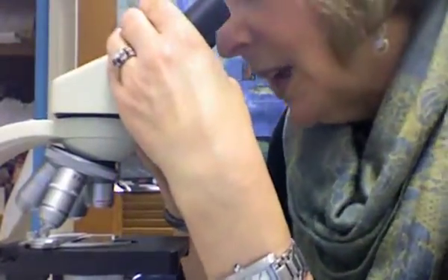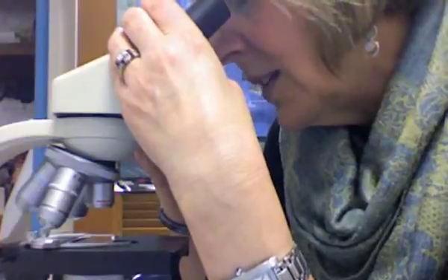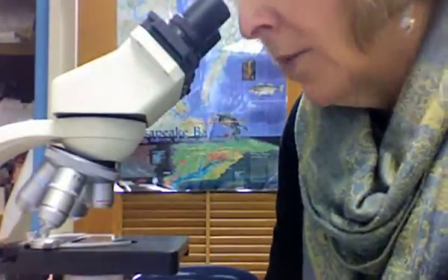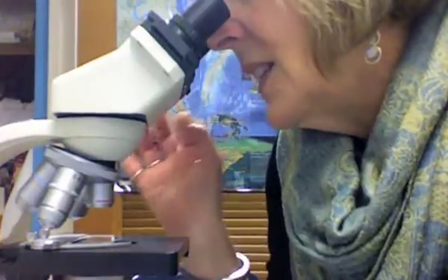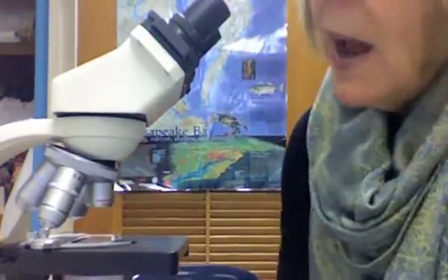Now I have my light turned on, my slide positioned on the stage, and my objective on low power. I'm going to look through the microscope. Adjust the eyepiece if it's a binocular scope so you can see comfortably. Then I can only go down, so I'm going to move the stage down until I see a clear image. Then I'll use my fine adjustment to get it very crystal clear. At this point it is focused on low power, and your teacher may want you to make a sketch of what you see.